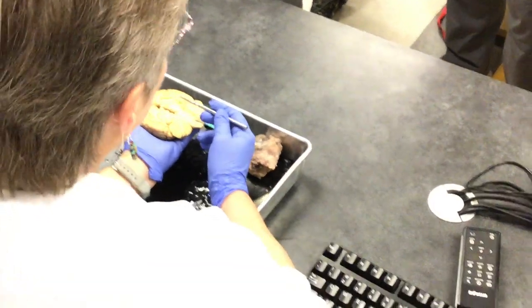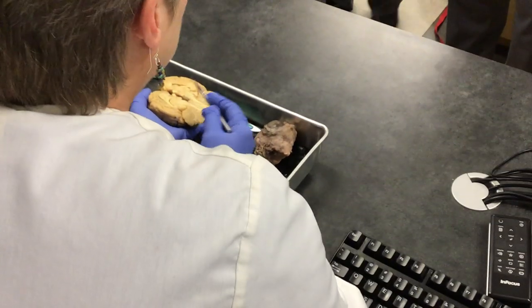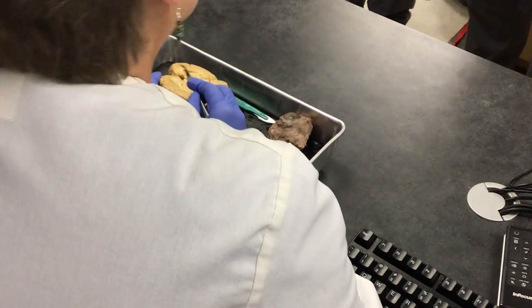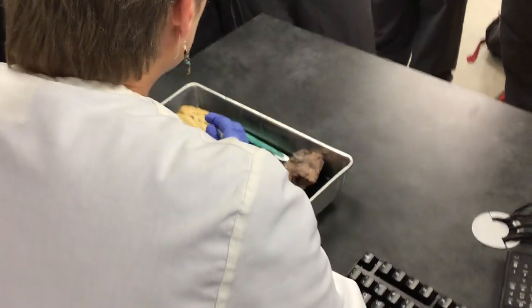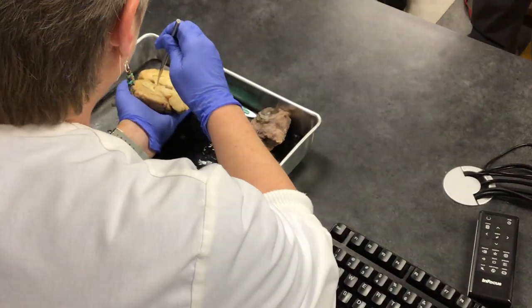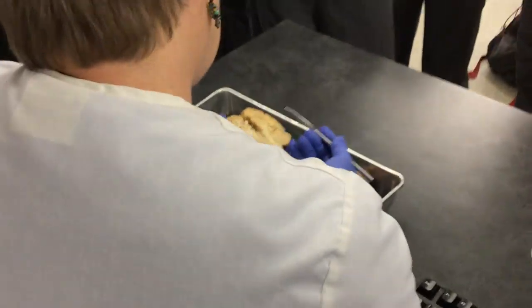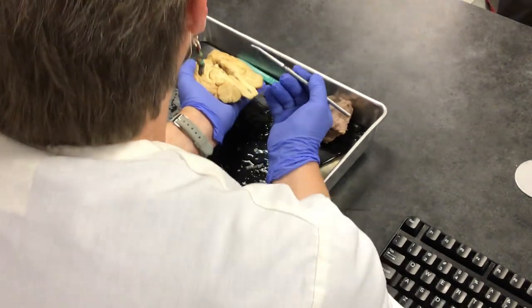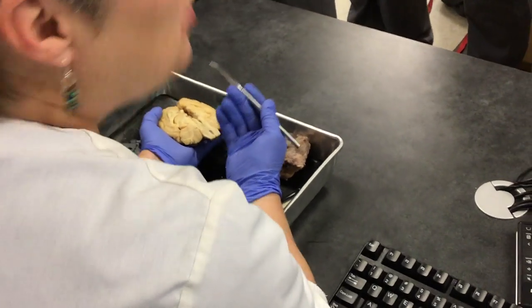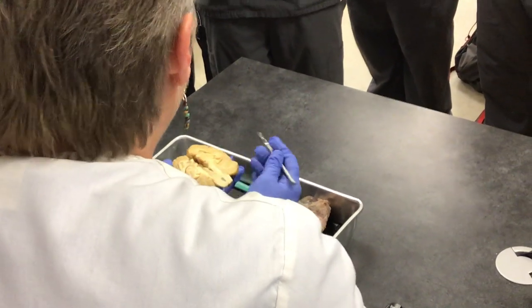This is the thalamus — it's the relay station for the cranial nerves. They all report to the thalamus except for one, and we'll talk about that next semester. Right below the thalamus is the hypothalamus — it's really hard to see on this brain. You already know one function: it's our thermostat. But it has a lot more functions.